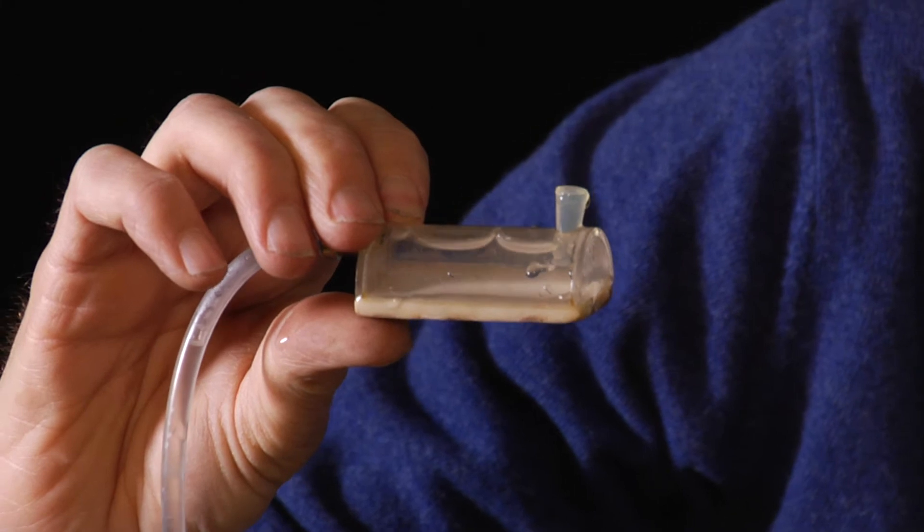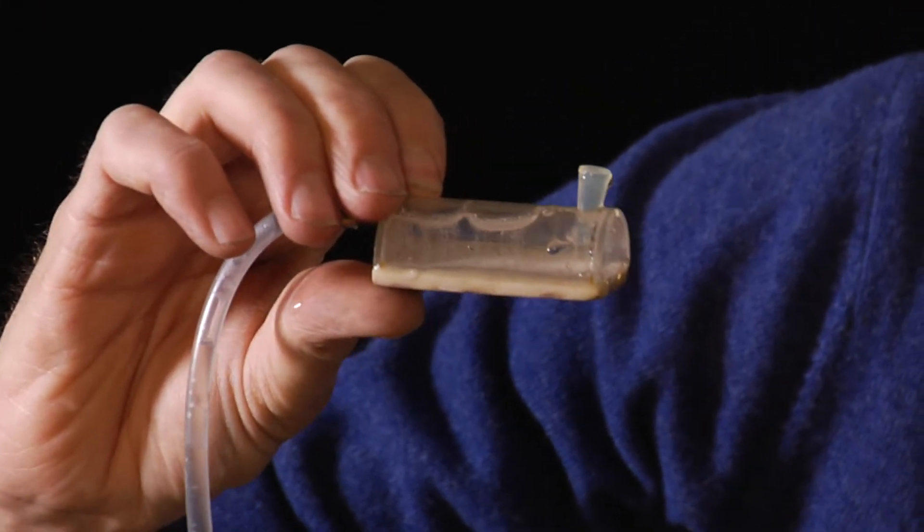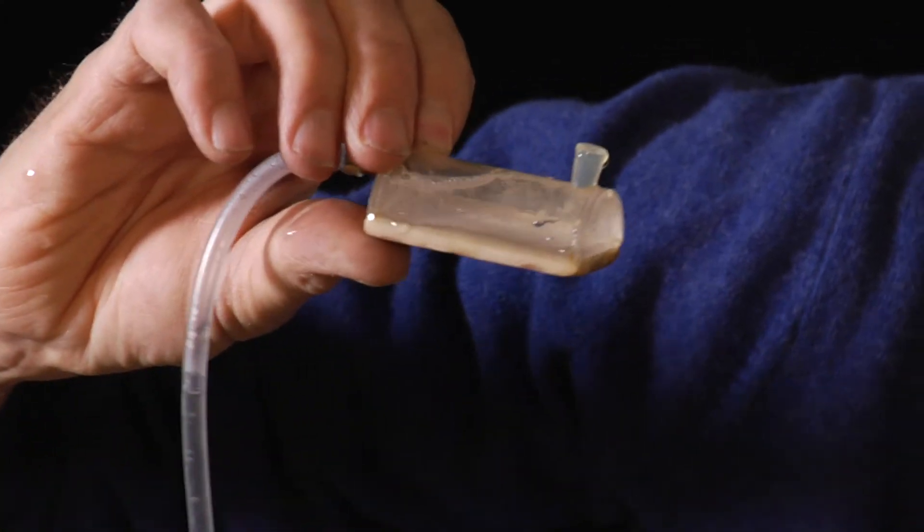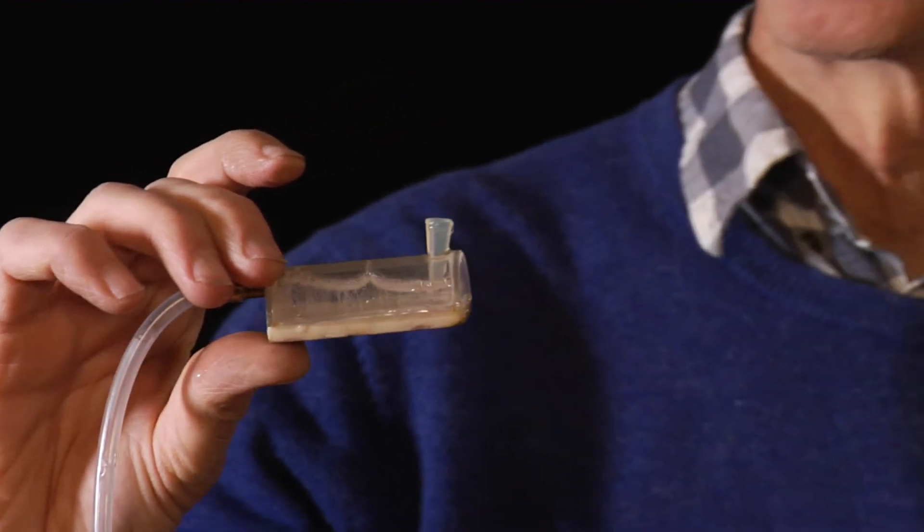It's a very well-defined level for which air starts to enter the biggest pores. If I lower still more, the plate empties completely and air flows in through the pores. The pores in this plate could stand a suction of about 70 centimeters.